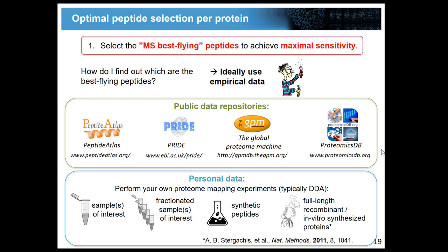You can also work with synthetic peptides, so there are various vendors who provide quite cheap synthetic peptides that are very dirty, but for this purpose of peptide query parameter generation, they're actually very useful. They cost in the range of 10 to 20 euros.